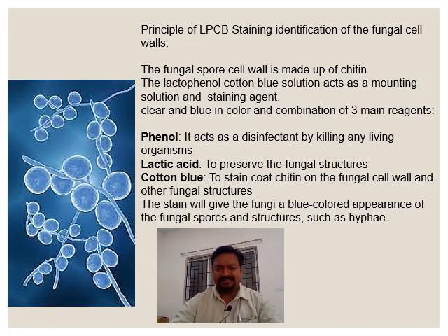The stain gives a blue color appearance to the fungal spore structures such as hyphae. Another material is glycerol, which keeps the prepared slide specimen from drying out. Slides are prepared for microscopic fungal examination using lactophenol cotton blue solution as the mounting medium and staining agent. Fungal components are brightly colored blue. Always wear gloves and work in a biological safety hood when performing these treatments.